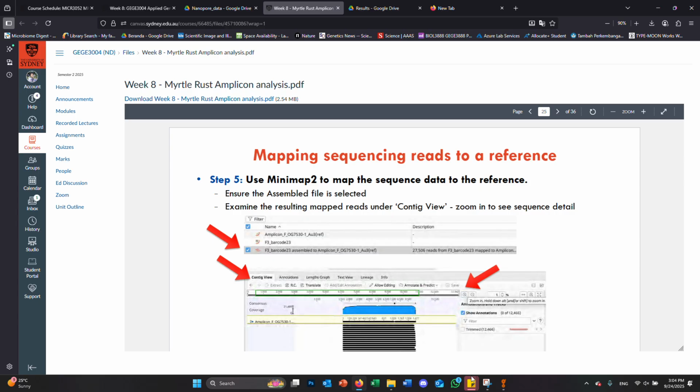Yep. There are some yeses and nods. Because we have so many errors in our nanopore reads, we can't just take one read and go, this is my sequence, because there's a high chance there'll be an error along that read. So we need to use sheer weight of numbers to eliminate all these individual errors within each individual read and make a representative sequence of all the aligned reads. This will take into account the most common nucleotides at each site to give us our consensus. So you can do this in Geneious pretty easily.